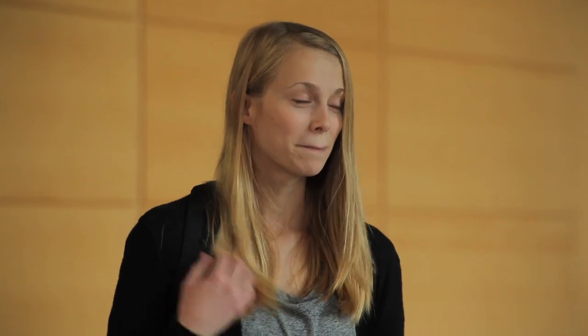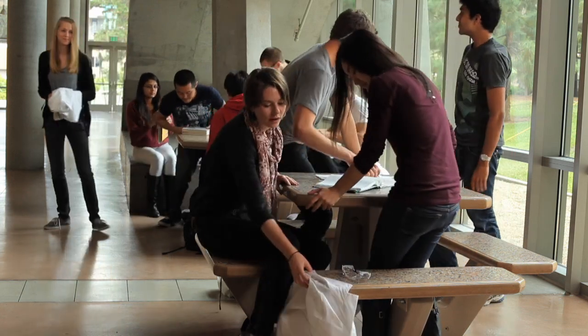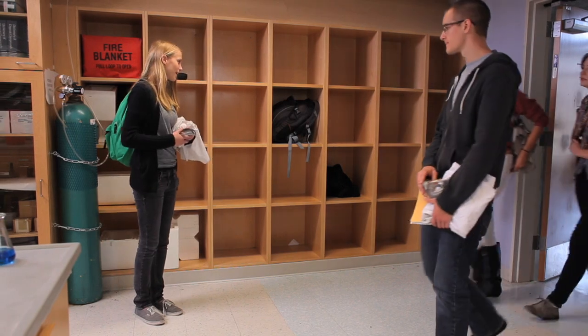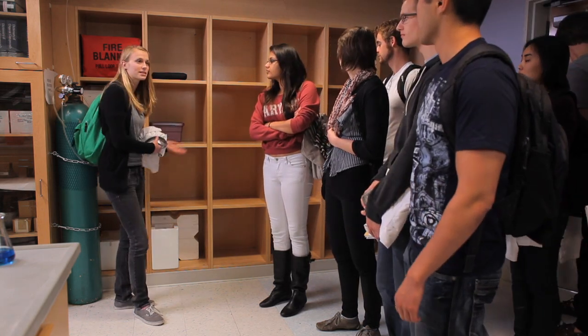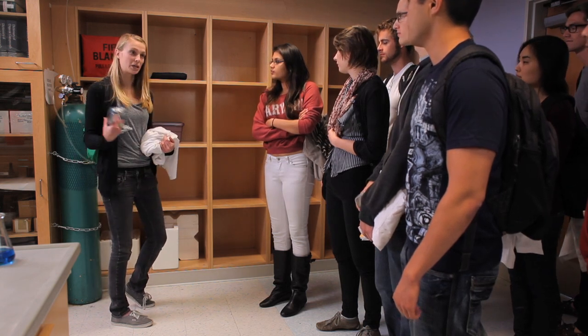Hey everyone! My name is Kayla and I'll be your TA for this quarter. Let's go on into the lab. Go ahead and put your backpacks and things in the cubicles, that way no one will trip over them. And grab your protective gear and come on to the front.